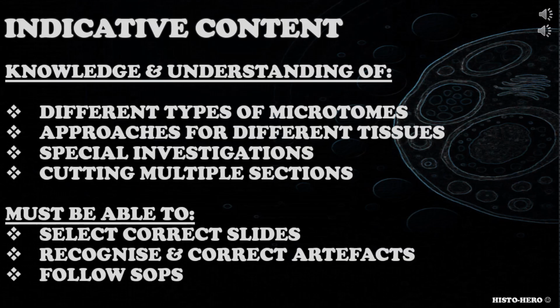Follow standard operating procedures for levels, serials, section coils, curls, and step sections appropriately to cut a range of tissue sections to the required standard, maintaining appropriate audit trail records.